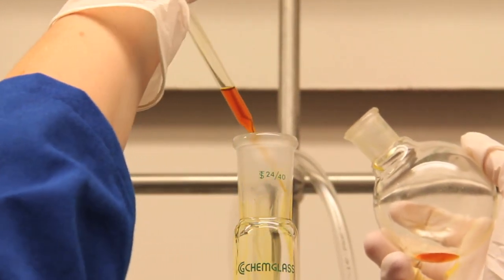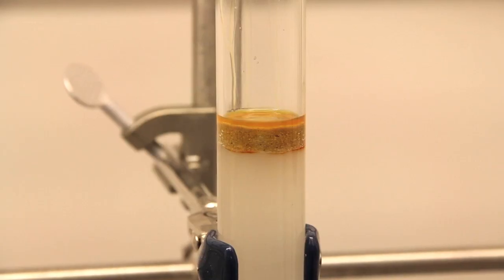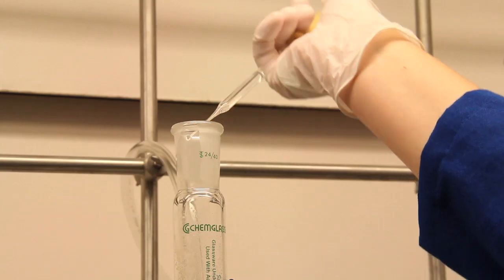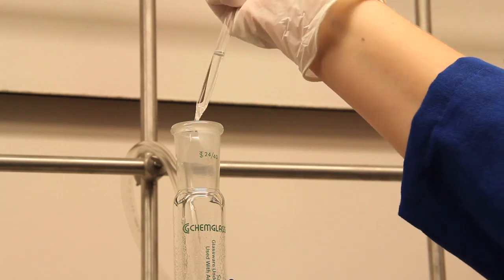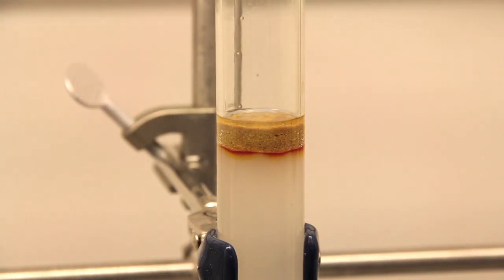I am adding the solution on the walls of the column in a circular motion. Now I open the valve and allow the solution to percolate into the silica. Now I add a little more solvent to wash the residue and I load it. This procedure is known as wet loading, but sometimes you have to use dry loading.